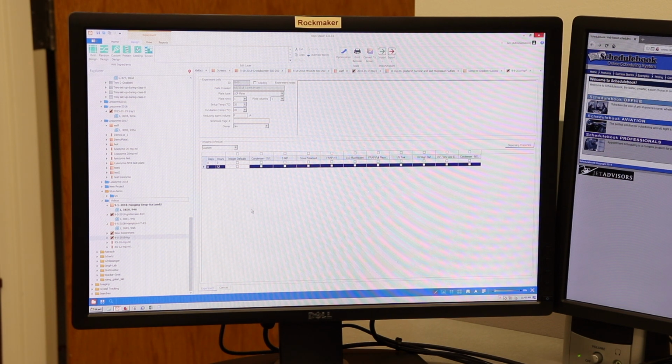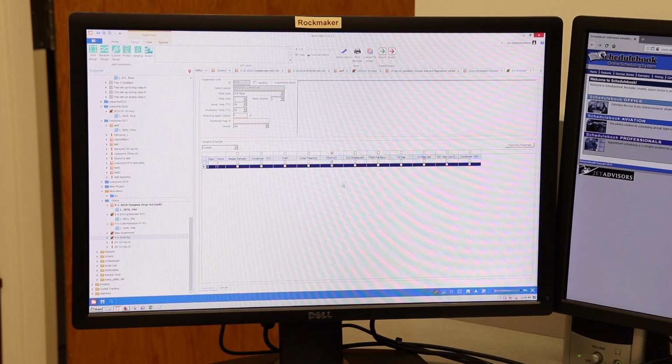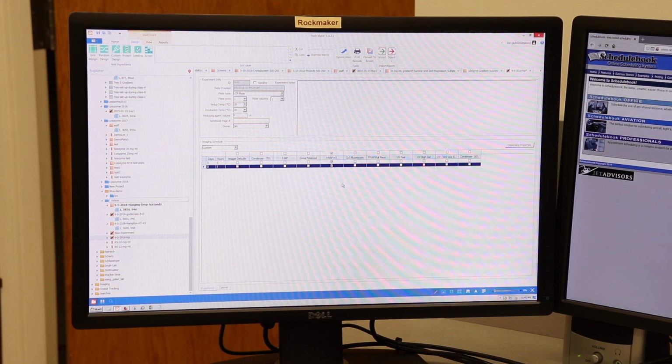And I typically like to set 2 imaging schedules, one immediately and one an hour later to do the same experiment, which is the FRAP high throughput experiment, using the default settings for that. And the reason for the 0 hours and the 1 hour is that when it bleaches a spot, it does it at a random position, and occasionally you may get a position that's not optimal. So that gives you a second chance.